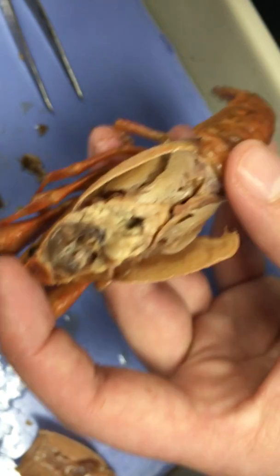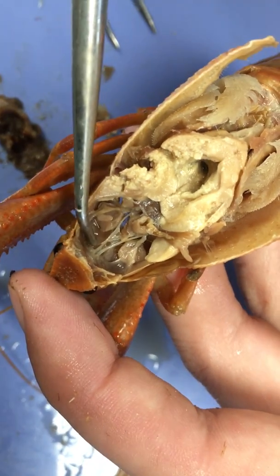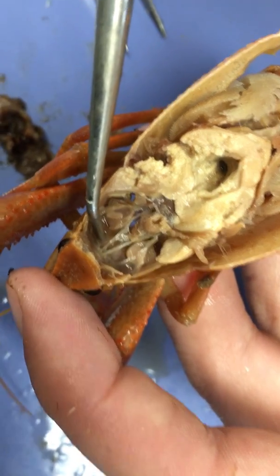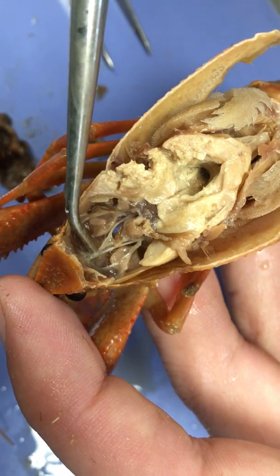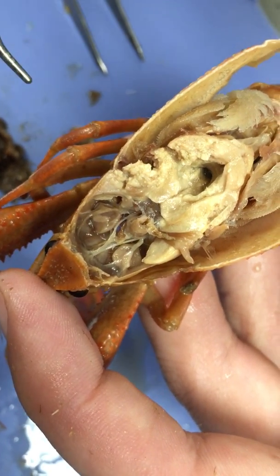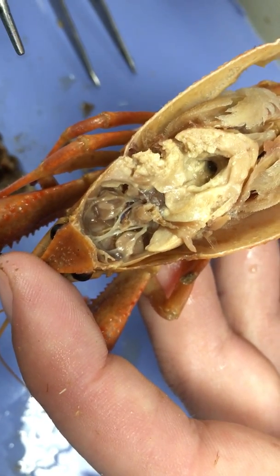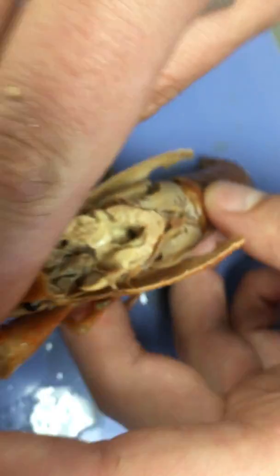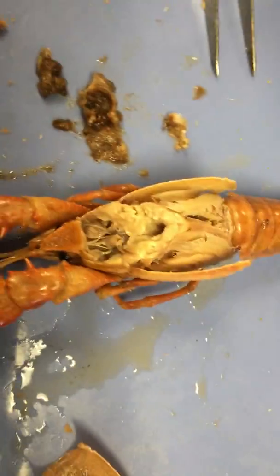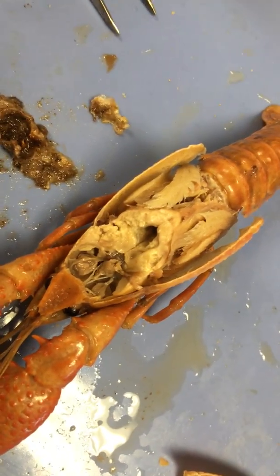Next, we can see the very impressive crawfish brain — these two strands of nervous tissue. That is the crawfish brain, essentially. They're not as smart as they look, and they don't look very smart to begin with. So we have the brain, the antennal glands, the stomach, and the mandibular muscles. Let's now move on to the rest of the crawfish.